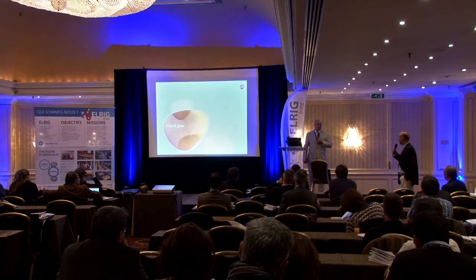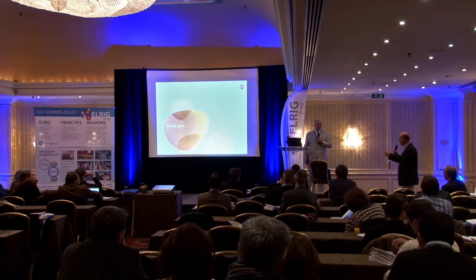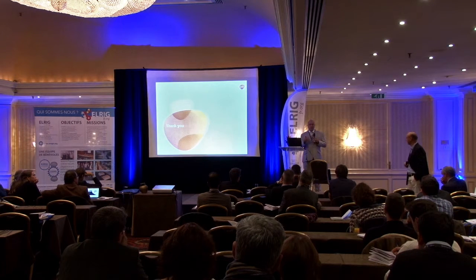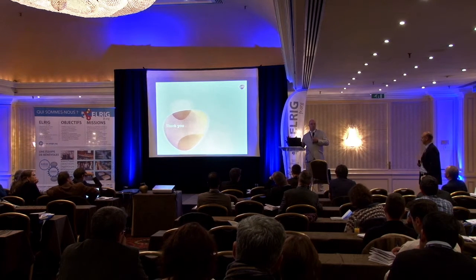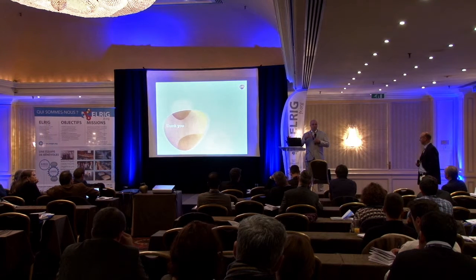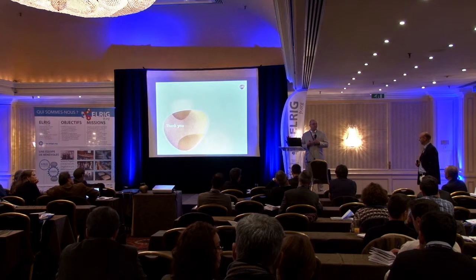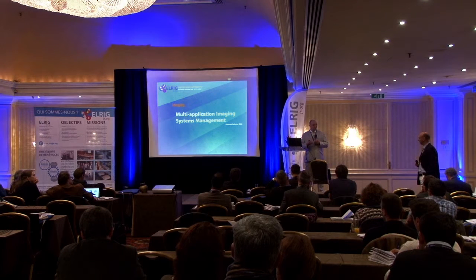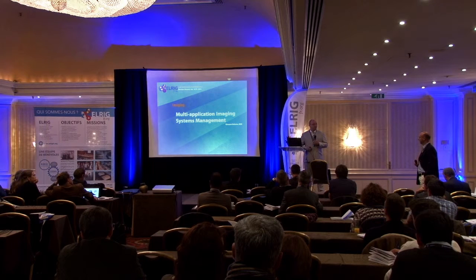And do you have to meet them physically, or can you develop remotely? Yes, it's very important because we are the link between the scientist and the supplier. So the contact with the lab, the scientist, is very important to understand what he wants, but also the constraints he could have in the test.